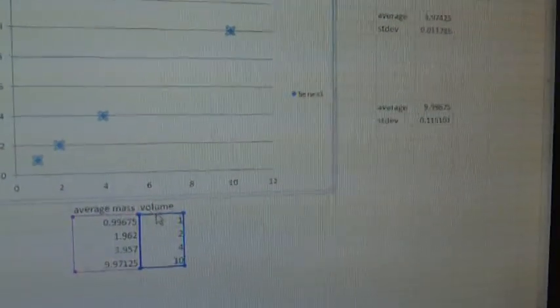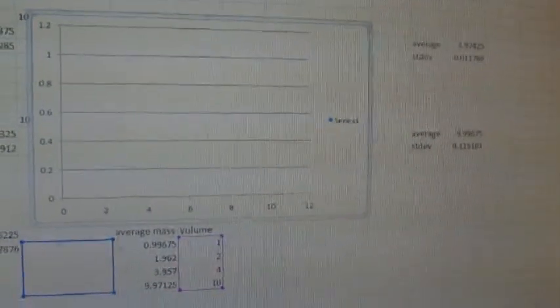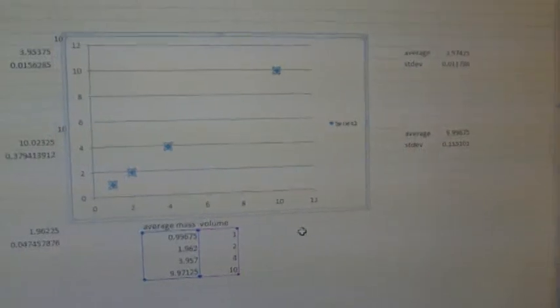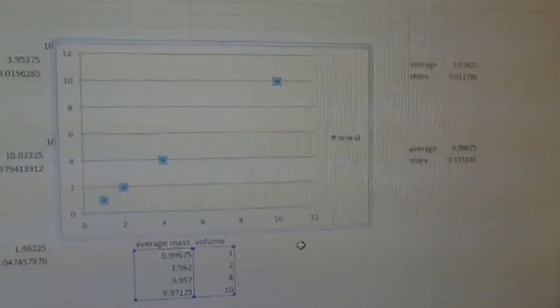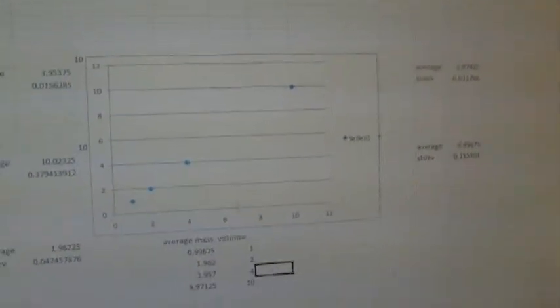We can highlight this data right there. Just highlight that data right there. Click on those dots, and then you can drag these boxes where you want them to be. Is that right? Right. Okay, then drag that pink one over to there. Whoops, there we go, and then drag that blue one onto there. All right, so now our plot is right with the mass over here and the volume over here, correct? Correct.